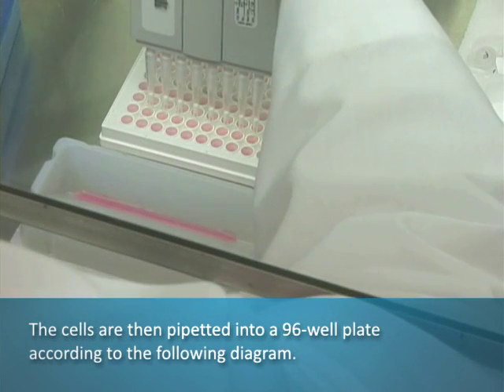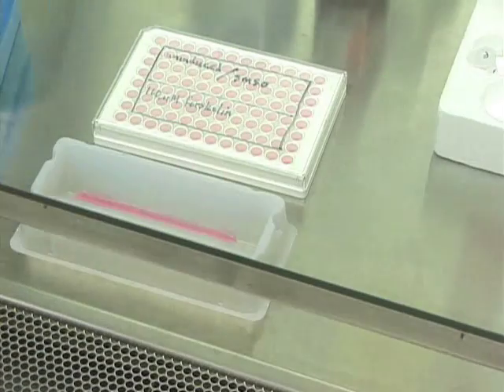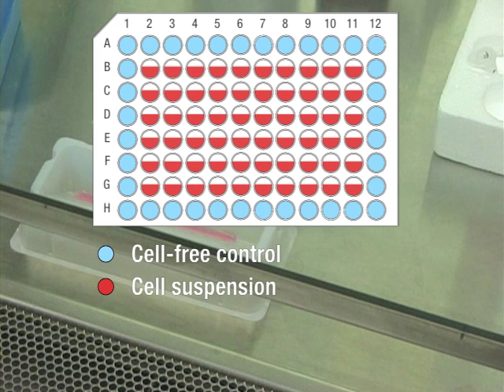The cells are then pipetted into a 96-well plate according to the following diagram. Cell-free assay medium was pipetted at 100 microliters per well around the perimeter of the plate as a background control. 90 microliters of cell suspension were added to the remaining wells.